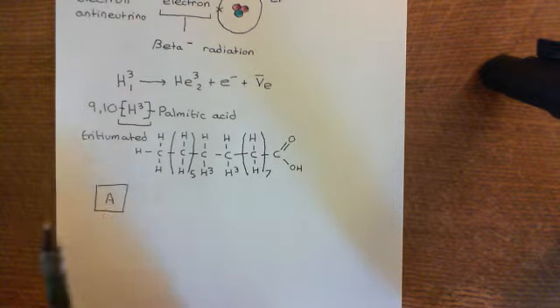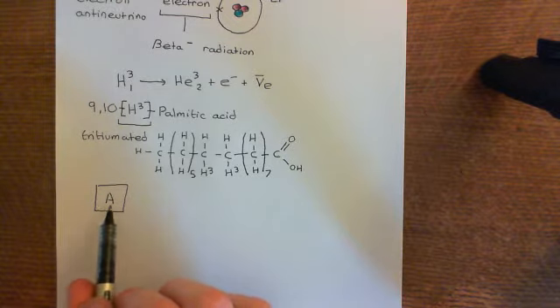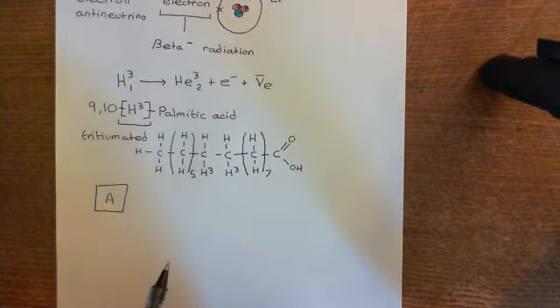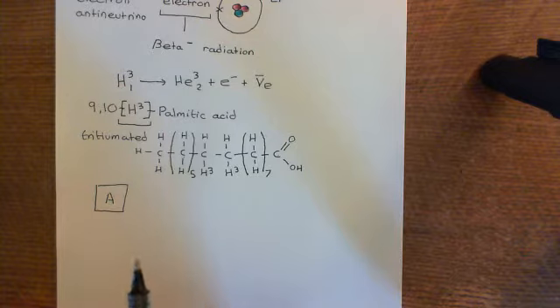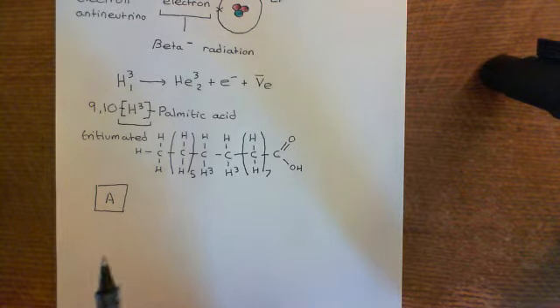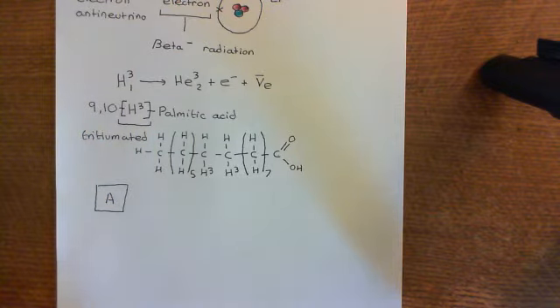Okay, and let's suppose we want to find out whether protein A is palmitoylated. Okay, so let's imagine that it is going to be palmitoylated, and then let's think through what the outcome of the experiment we're about to do will be, and then we'll think about what would have happened if it wasn't palmitoylated, and we'll see how the result would have been quite different, and therefore how this experiment allows you to determine whether protein A is palmitoylated or not.